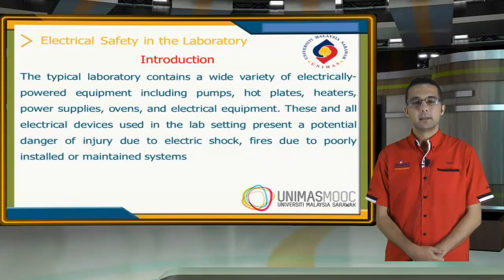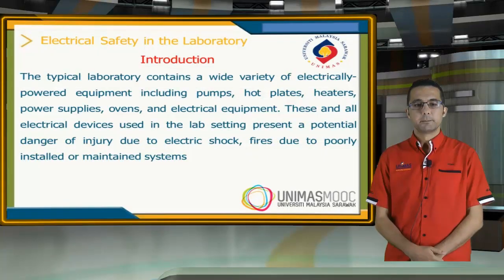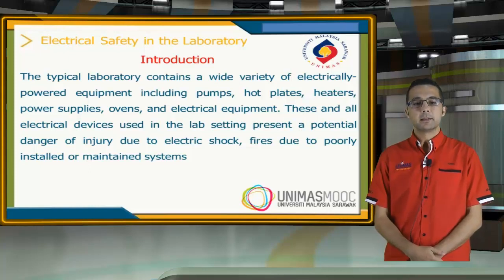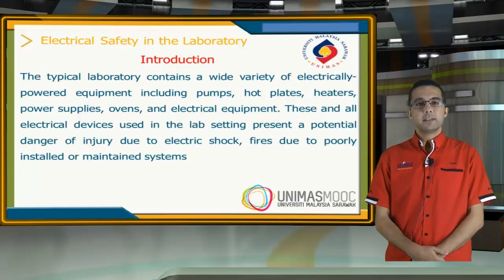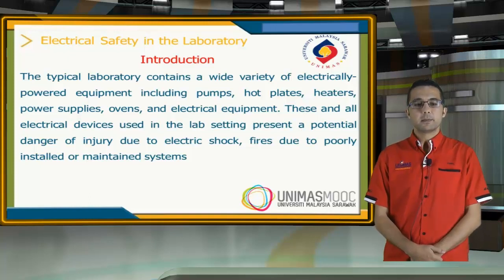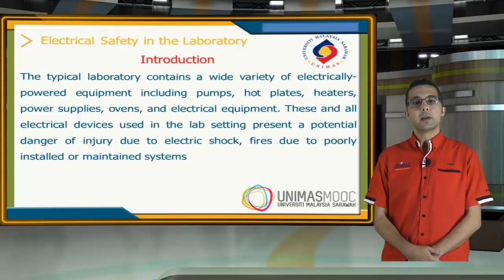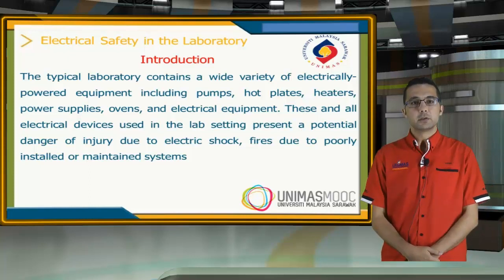In this unit, I will represent the electrical safety in the laboratory. The typical laboratory contains a wide variety of electrical power equipment, including pumps, hot plates, heaters, electrical devices, and other equipment. These devices and other equipment present potentially dangerous hazards for injury due to electrical shock and fires.